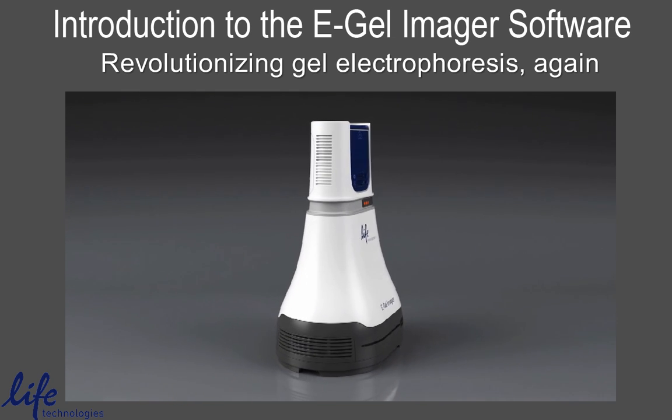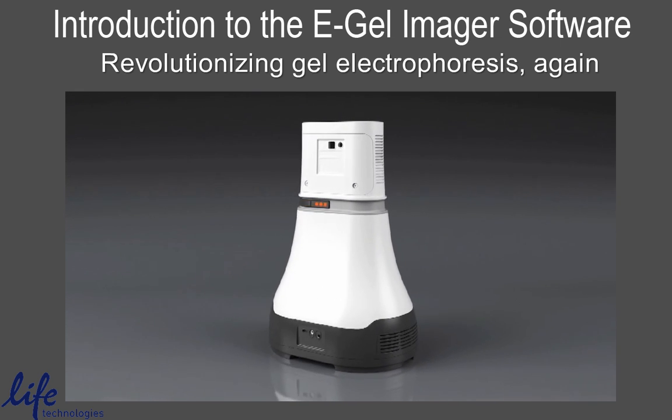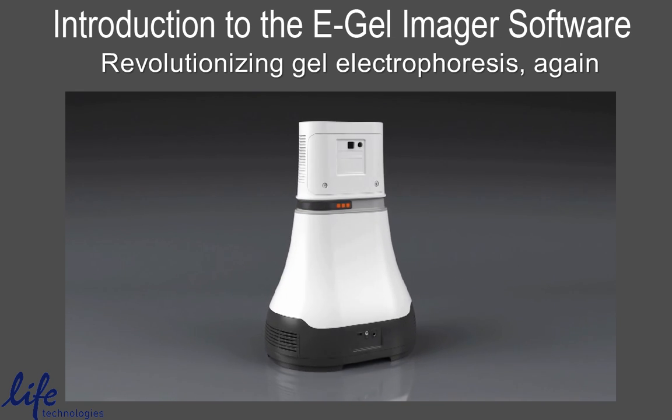This video will present the new eGel Imager basic capturing and editing features.